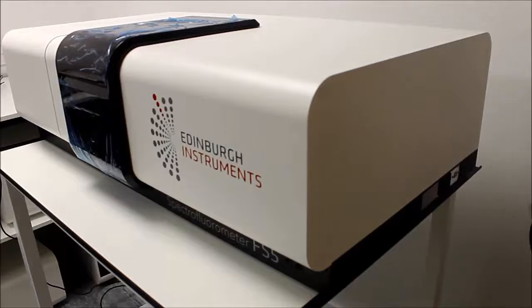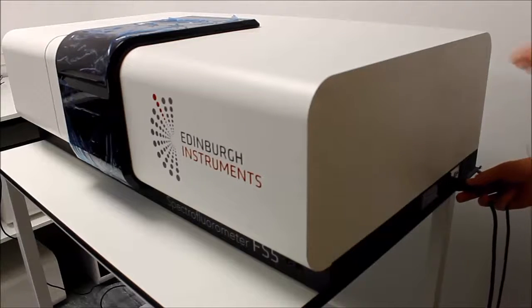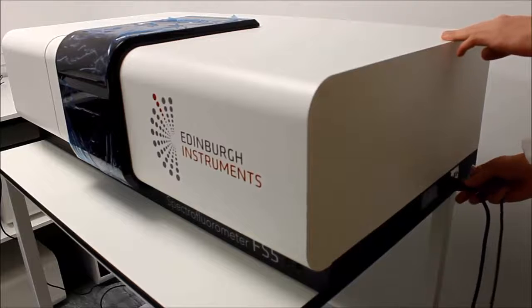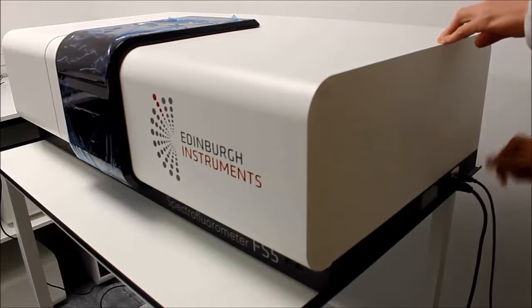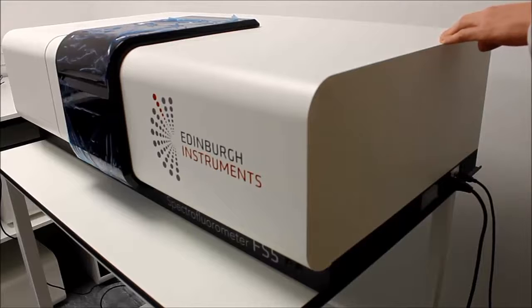The first steps in connecting the FS5 are to connect the power cable and then the USB cable, and switch the power on.